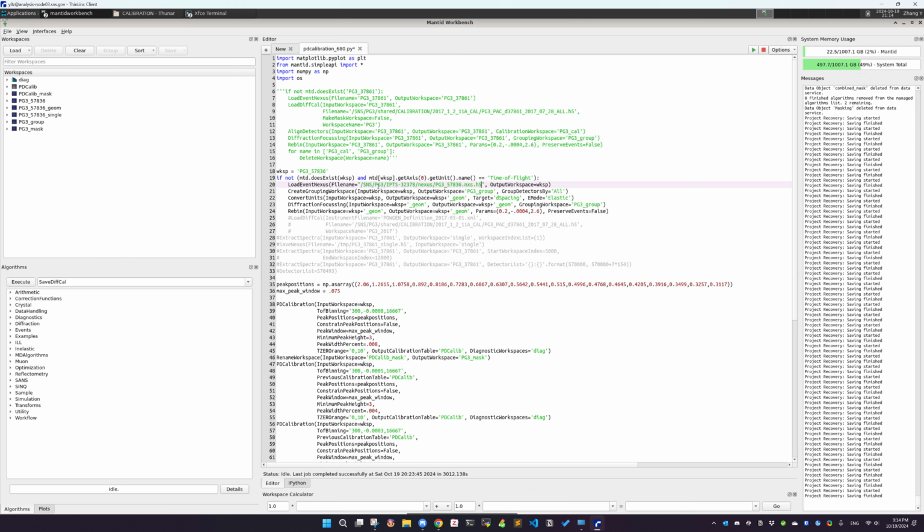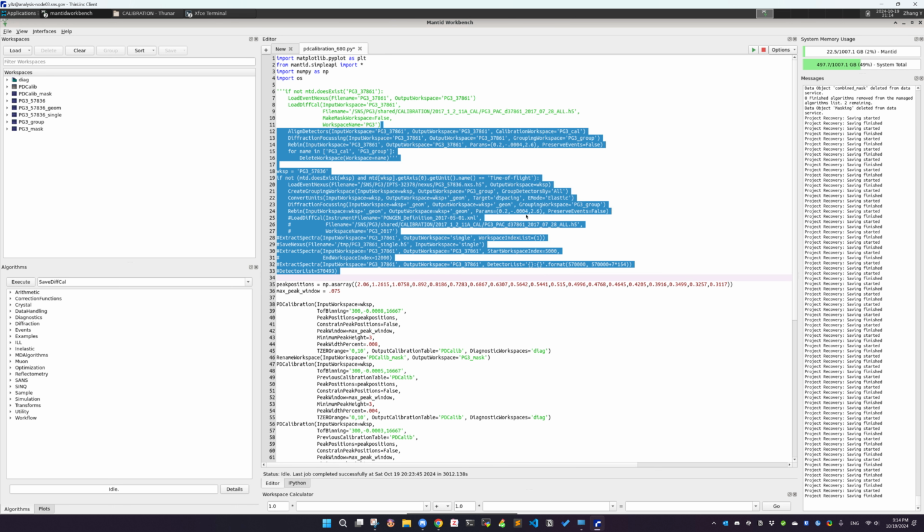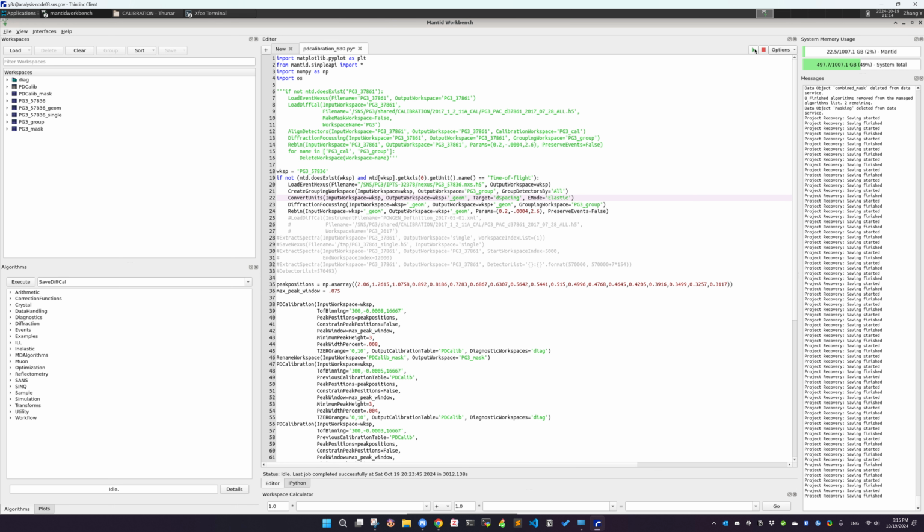So that's only to be used if the original way of doing it is not working. If it is not working, just put in the full file name, and that's the only thing we need to worry about. And then after that, let's just click on this run button.